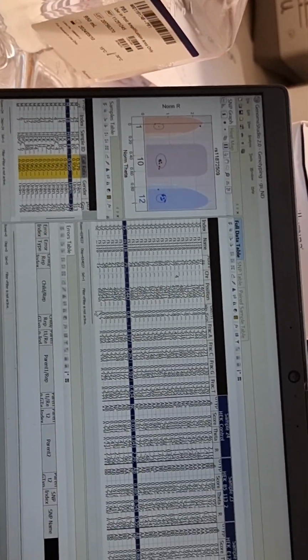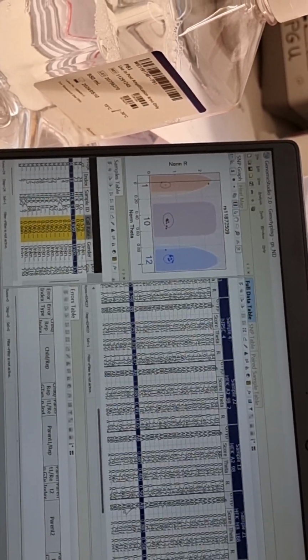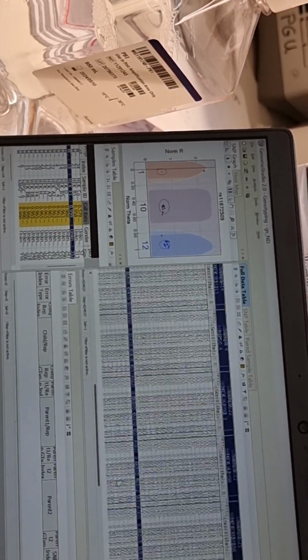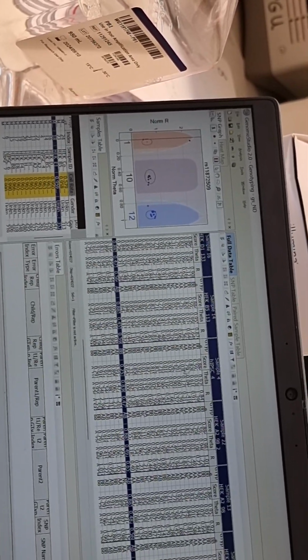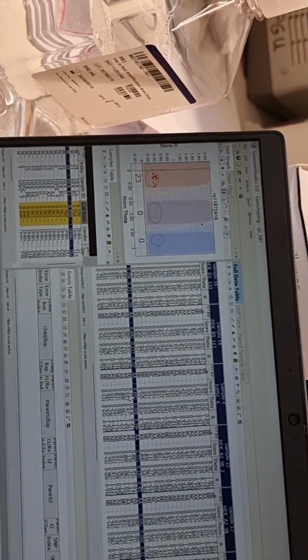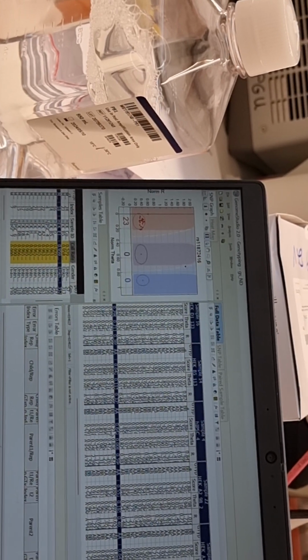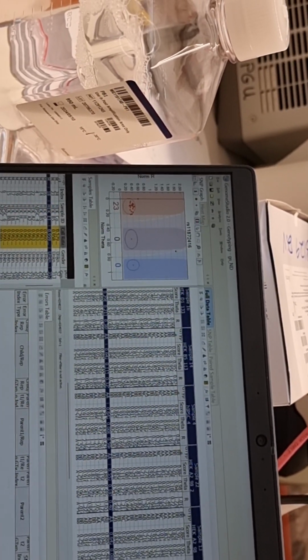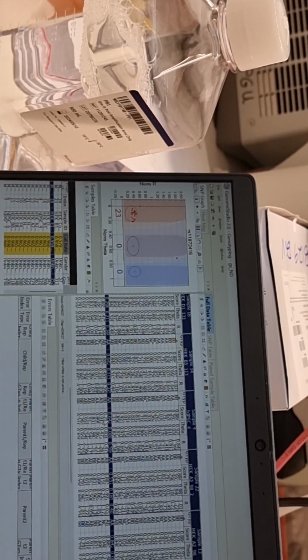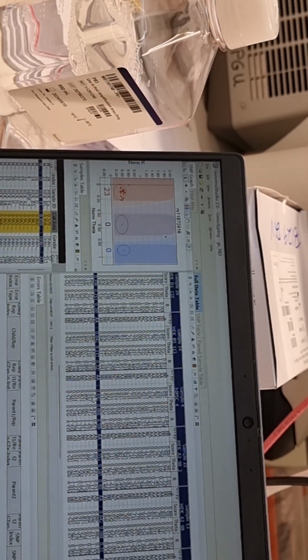Why should the CRISPR edit give a different value? Because it affects the intensities. The IDAT just reads the intensity of the fluorochrome as you shine a laser on it. CRISPR doesn't do anything, but it changes the levels of intensity. If you have indels, it affects the way it normalizes all of the intensities afterwards.